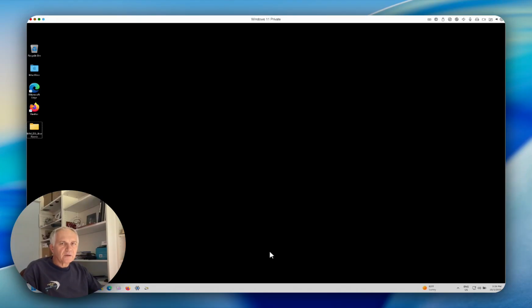Hello, let me review today data reduction for the USAXS SAXS and WAXS instrument at the Advanced Photon Source.